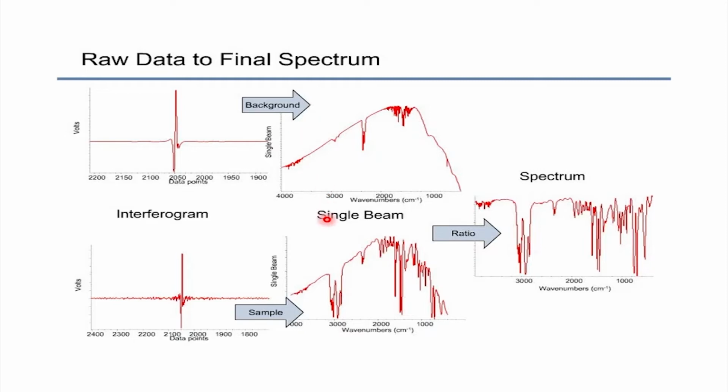Now, the second time, you keep the sample and record the spectrum. So initially we record the background. After recording the background, we keep the sample and record the spectrum. This is the spectrum you get when you keep the sample, but you can see there are already absorption bands from the background. We don't need these absorption bands coming from the background, so we need to remove them.